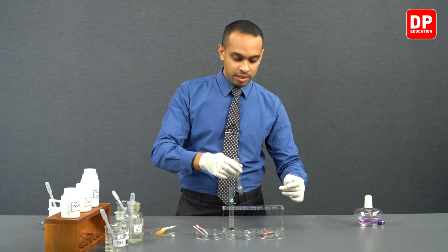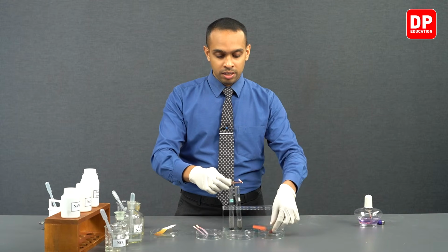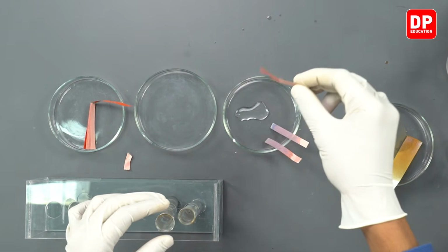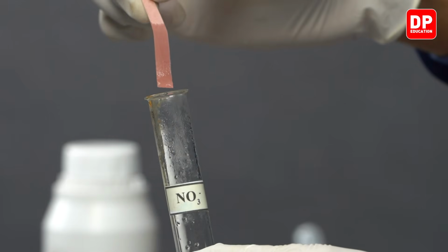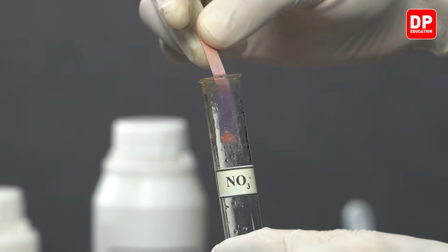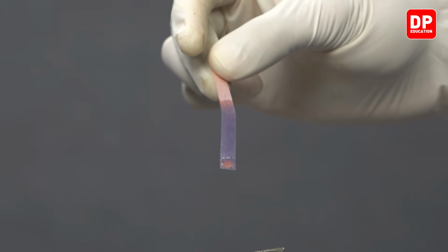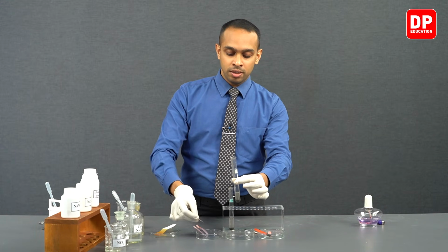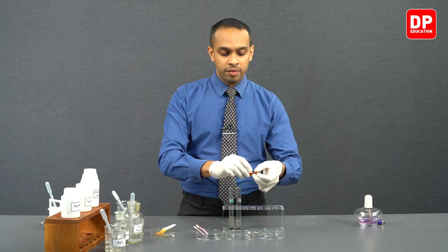And we can further observe that if you take a piece of red litmus paper, soak it in water, and if you insert this red litmus paper, you can observe it turning blue. So a red litmus paper will turn blue when exposed to ammonia gas. So that is why we observe this red litmus paper turning blue. We can observe it one more time.